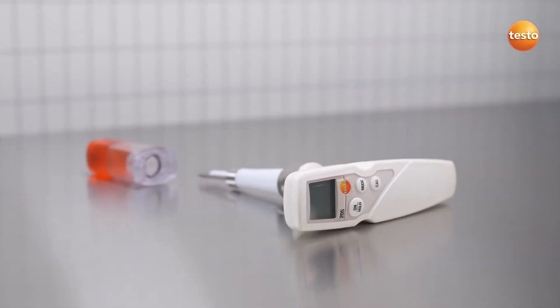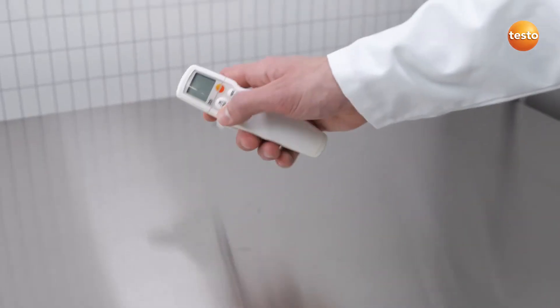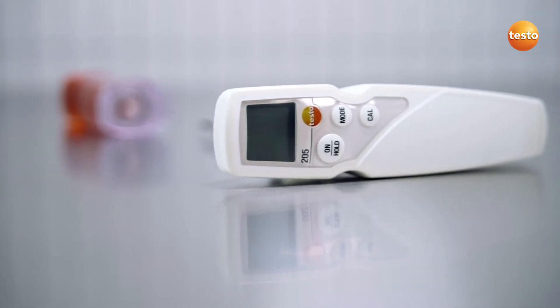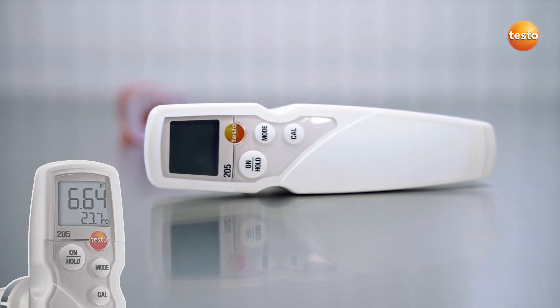Testo 205 is your hand-held measuring instrument for the combined measurement of pH value and temperature. All components are HACCP certified for use in the food sector. Especially useful, the display shows you the pH and temperature values at a glance.